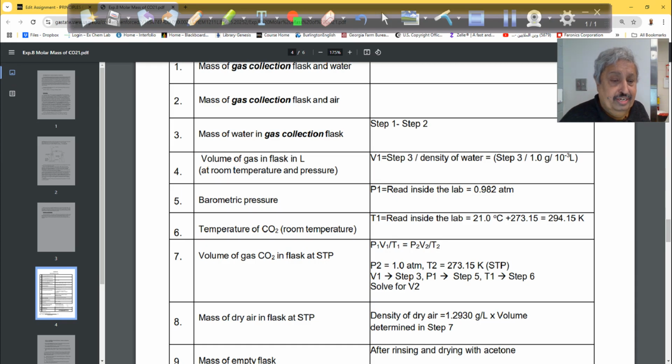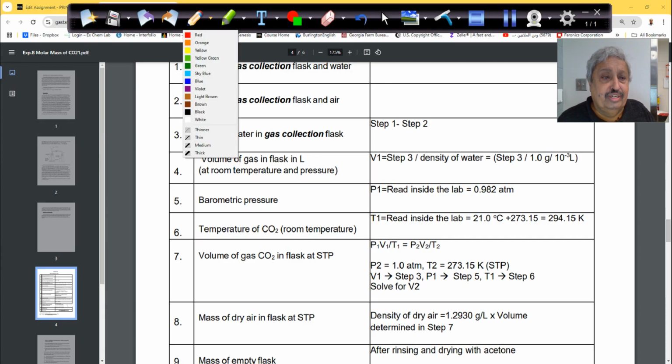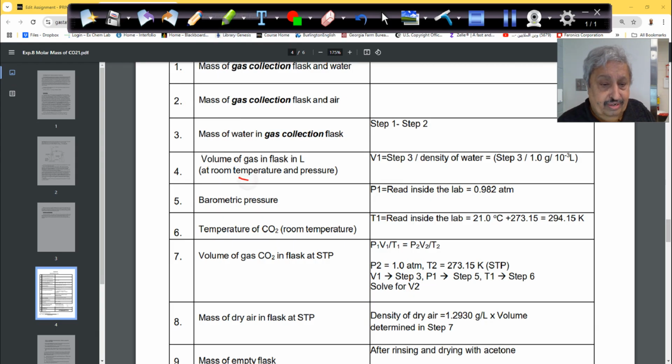So in this step, I get the volume of H2O and the volume of the gas itself, correct? At room temperature and the pressure. Those room temperature values, as I said, use theirs. That's local conditions here. Please write a note for yourself: this value here and this value here are local conditions. Because we know that STP is 1 atmospheric pressure for pressure and 273.15 Kelvin for temperature.